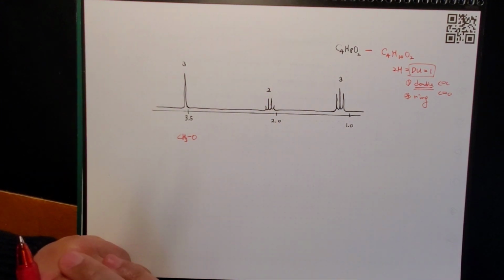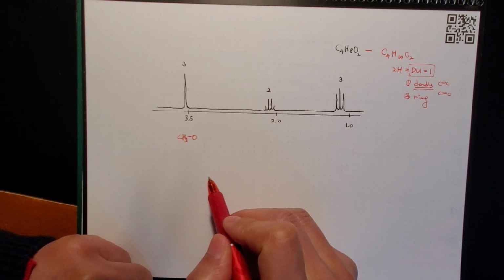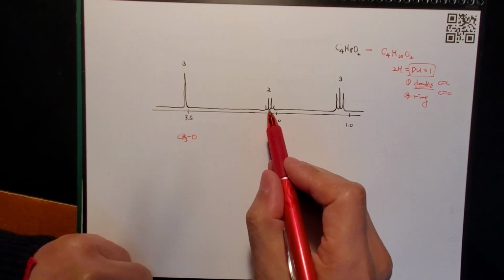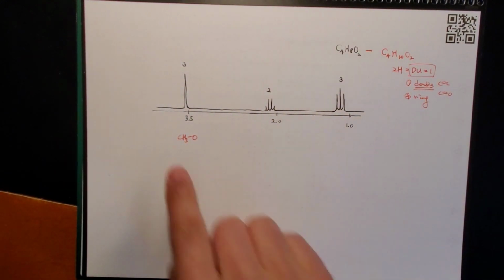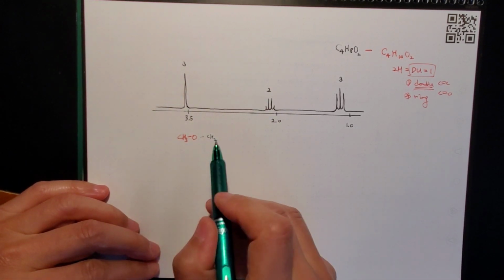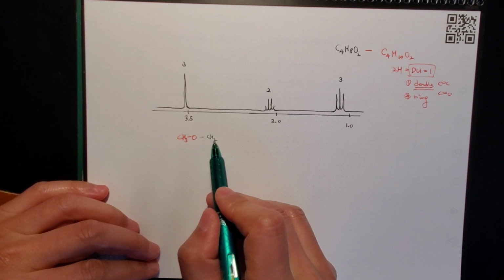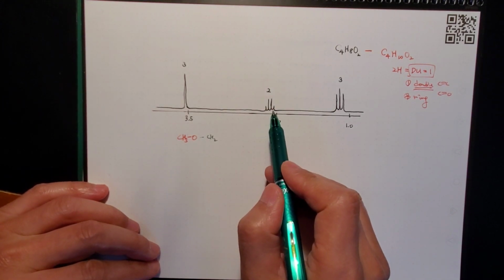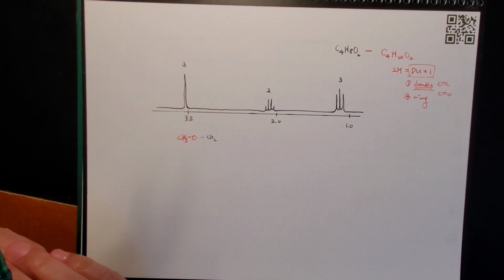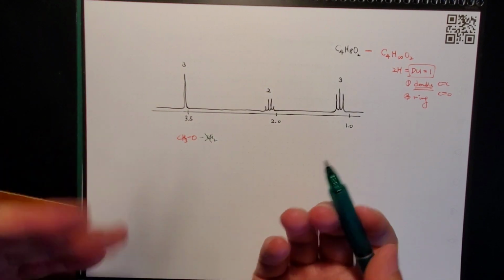And this one here, it's near 2.0, and you have another oxygen. All right, can this be on this oxygen right here? Can you connect it here like a CH2? No, because then you are alpha to the oxygen, so the ppm should move more downfield. So that's not the case. So what is it then?